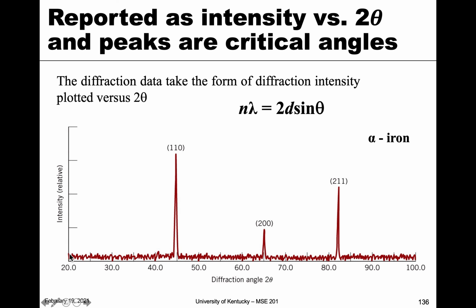So you see down here at the lowest angles recorded, we have a minimal amount of intensity of X-rays. So basically there's always some very low level of X-rays just floating around, right? That's known as our background. So you see it's jumping up and down here a little bit, but this is our background. So all of this down here.